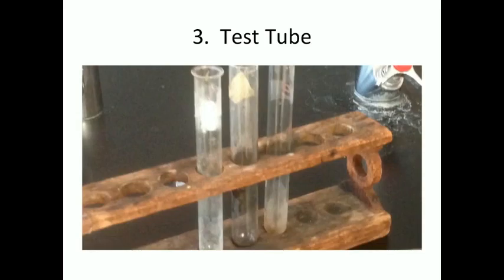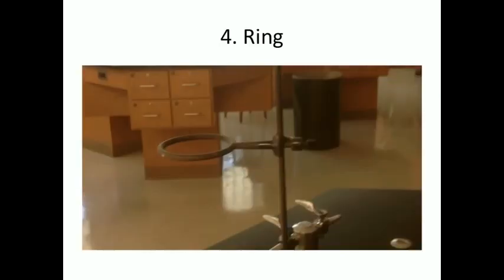This is test tubes. We use this to mix liquids and solids and to prevent splattering, and we can observe reactions through them. These test tubes are not as clean as they should be, but possibly we should use a test tube brush to clean them in the future.